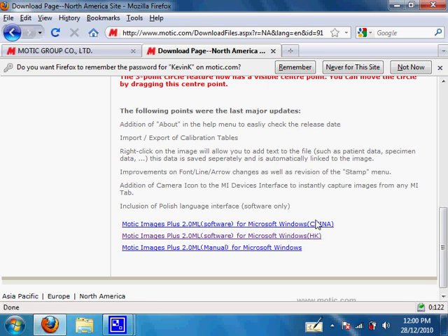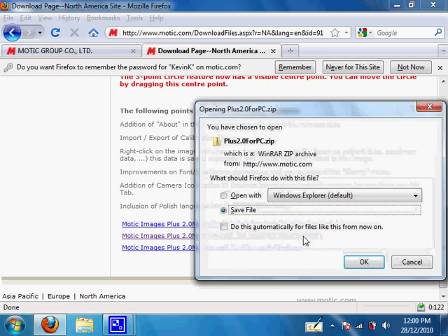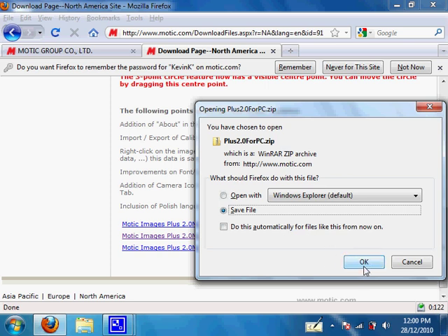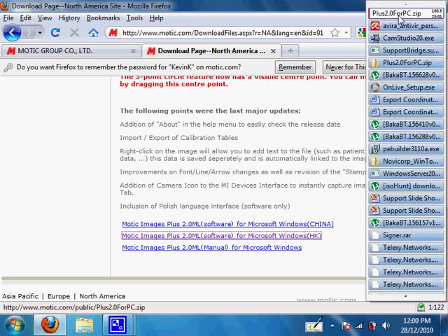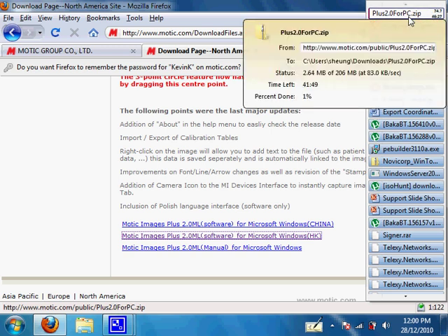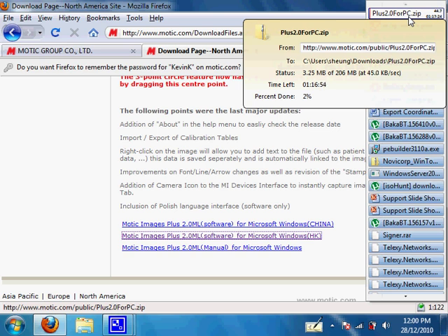Once we get to this page, click on the one that has the bracket HK at the end. The China option is another mirror but it's a bit slower, so we'll go with HK. Once you get there, save the file to your desktop if possible. It's downloading Plus 2.0 for PC.zip — the size of the file is 206MB. For your version it may be different, but once it's finished downloading, check the size to make sure you downloaded the whole file.